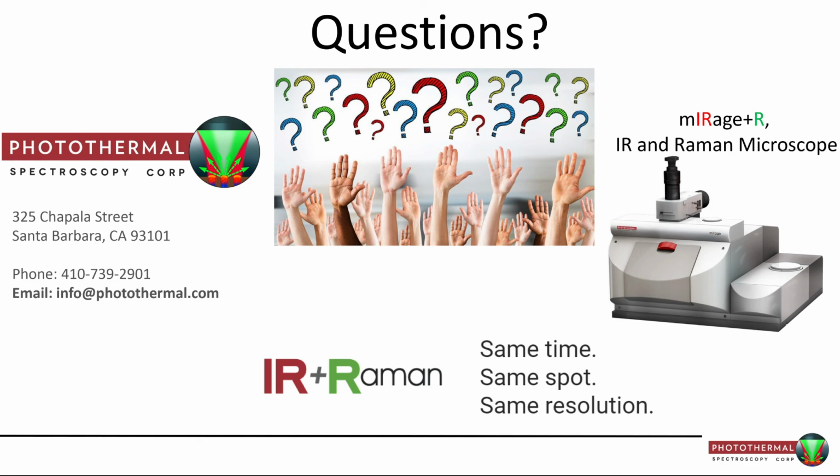And what's the next one here? Yes, this is really the last one. How does the sensitivity compare to Raman? Well, I'll get your take as well, Victoria, in a second. But in my experience, Raman is known to be quite a low sensitivity technique, fundamentally, because of how it works.